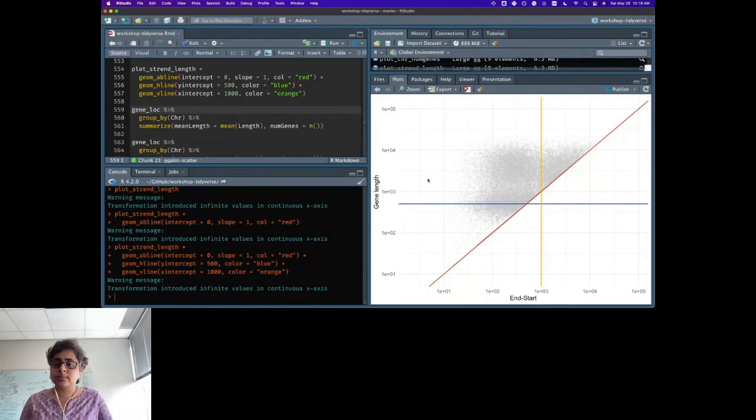No? Okay. So here what we are plotting is basically the gene length against the end minus start. So we are basically saying the upper limit is what is defined really by a gene length. But based on the different splice forms, based on the different combinations that you see in your data set, your different transcripts, you could see that they might be shorter than that.